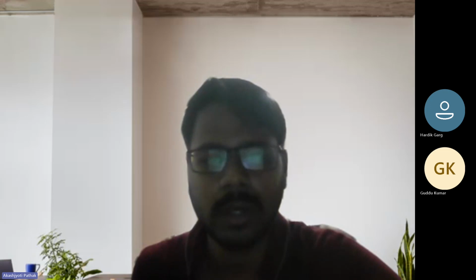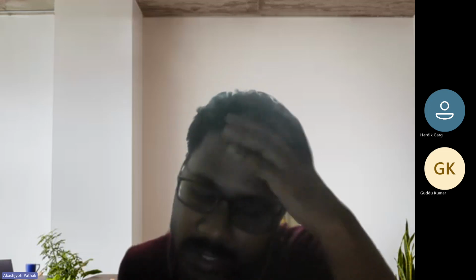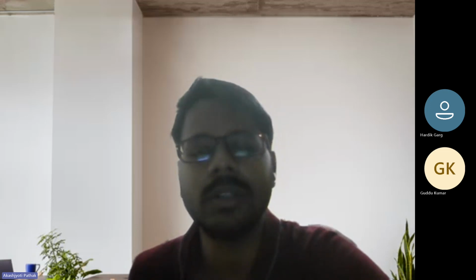Similarly, in this rho 3 expression, the T2 relaxation was not considered. But if we consider the T2 relaxation, then this again will be multiplied by this factor, minus T1 by T2 star, 1 minus alpha plus alpha T2 star by T2. So this multiplication by this relaxation factor causes the scaling of the line width.